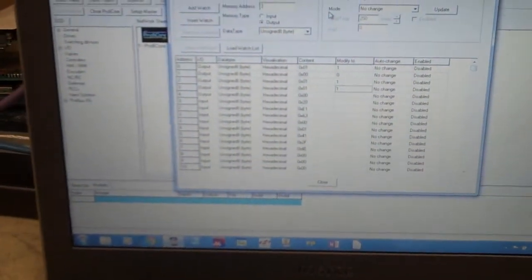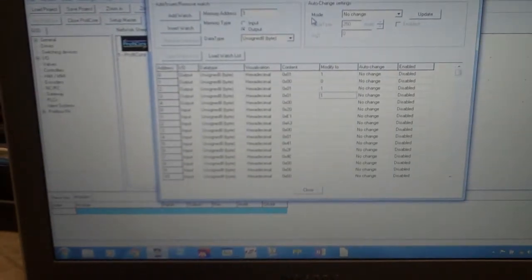So that's the demonstration of the 2000 software, now updated to be able to change the range and therefore change the application, using the same setup that you were using before for the 4060 type analyzer or GC Pro.